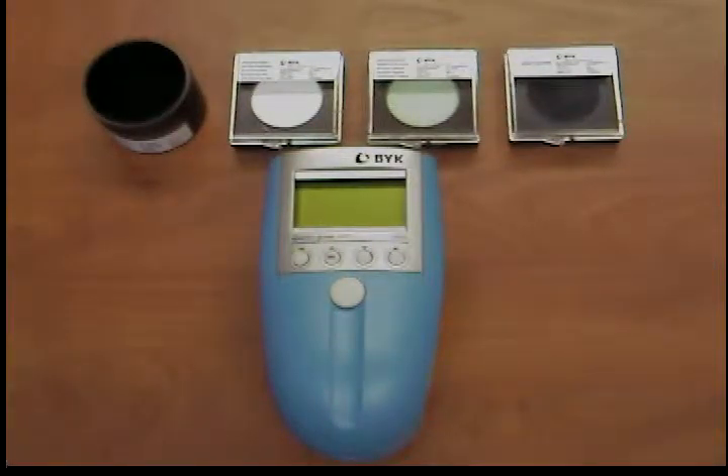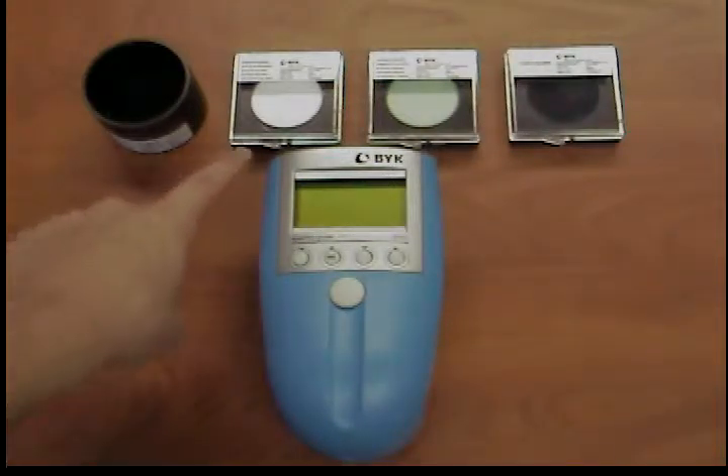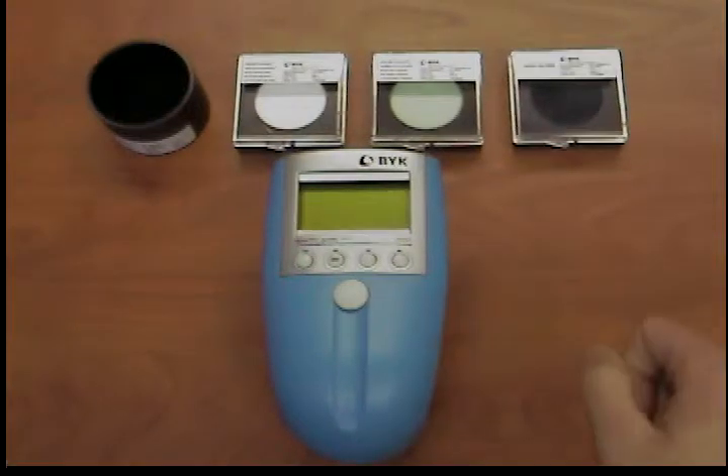Calibration with your Bick Gardner Spectra Guide. Three calibration standards are supplied with the measuring instrument. These include a black standard and a white standard for calibration of the instrument, as well as a green test standard.